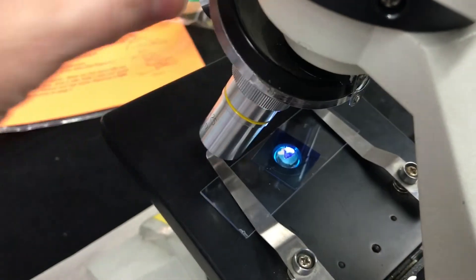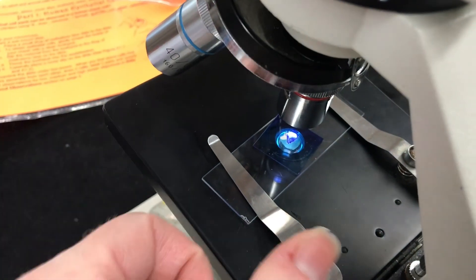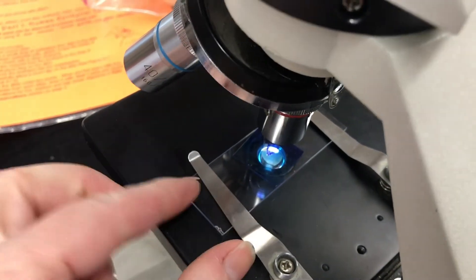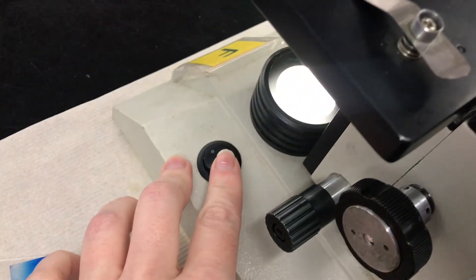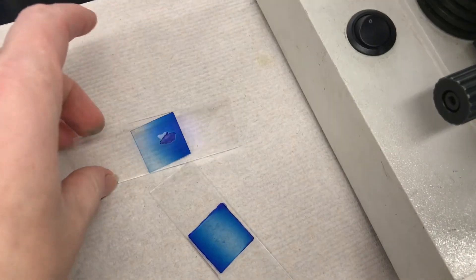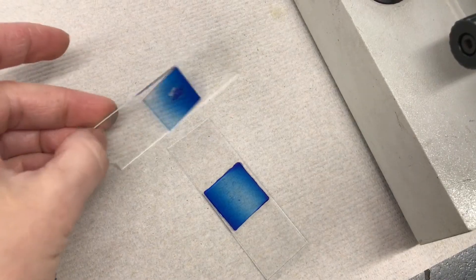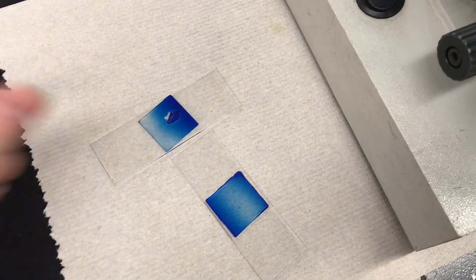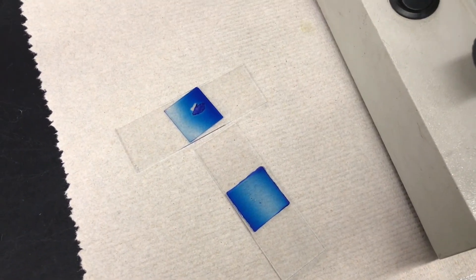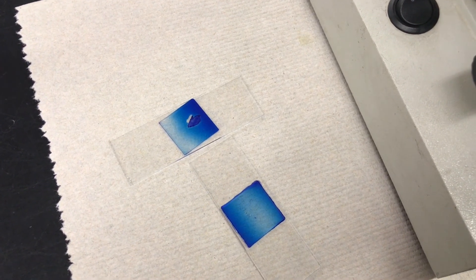When you are finished, put your microscope nosepiece on the lowest magnification, remove your slide, turn off the light, and clean your slides by dipping them in your waste container beaker. Dry them off so that they are ready for the next class. And there you have it — how to make a wet mount slide for both cheek and onion cells.